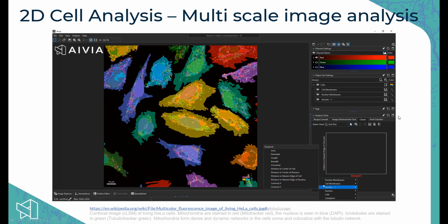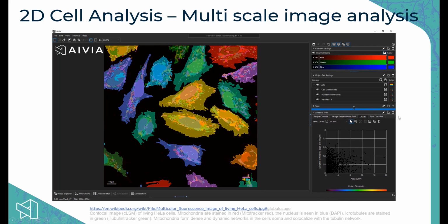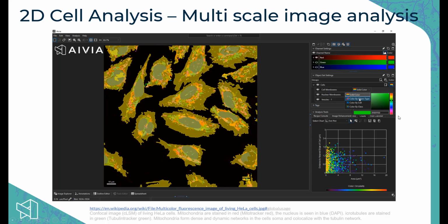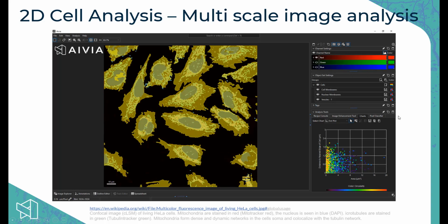Very quickly you get the measurements calculated, and you can start to interact with any of the measurements that are pre-calculated. It is possible to add a lot more measurements through the spreadsheet tab, but in this example I just have a few measurements to explore the results. We'll have a look at this in the demo in a moment.